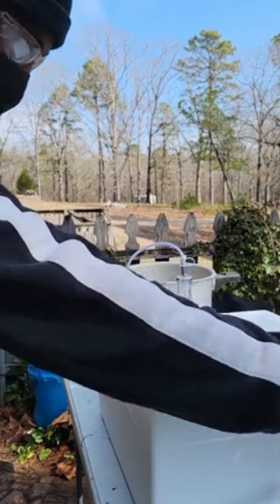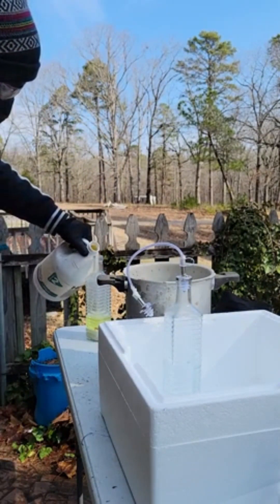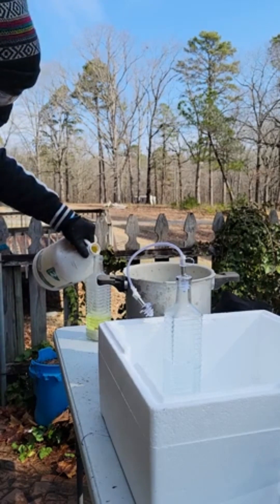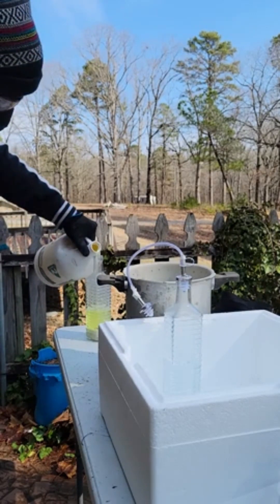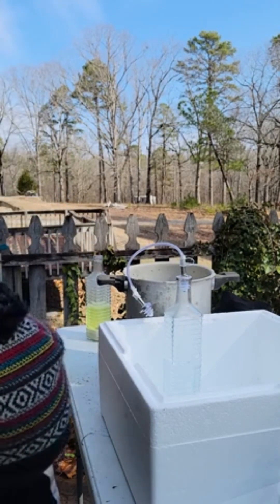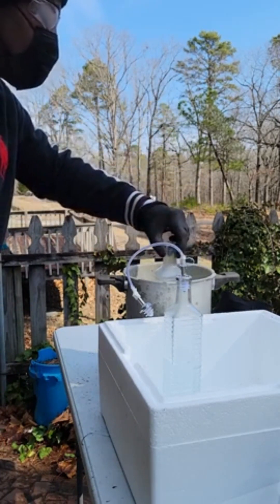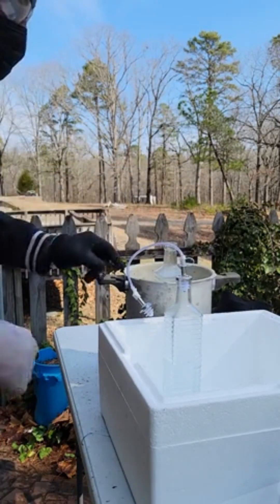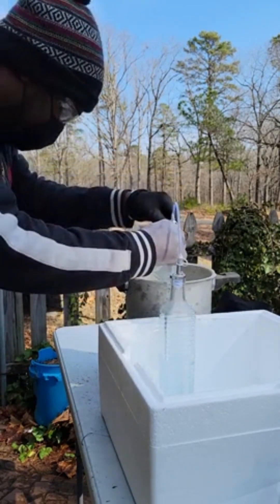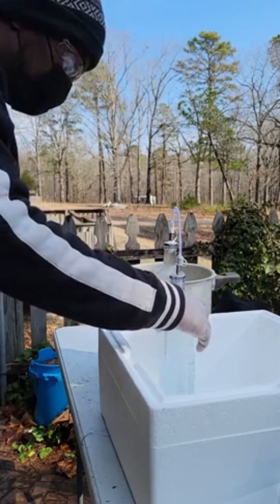Let's go. We just got a little bit of warm heated water there. I'm going to close this off, and we'll check back in a second once it gets going.